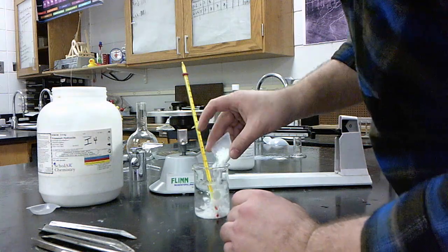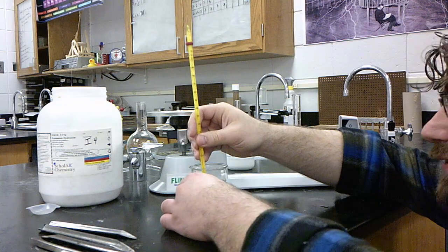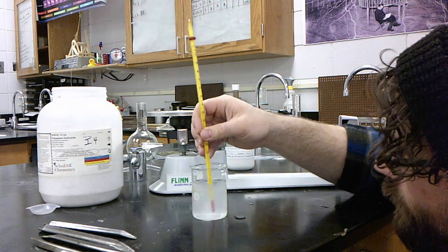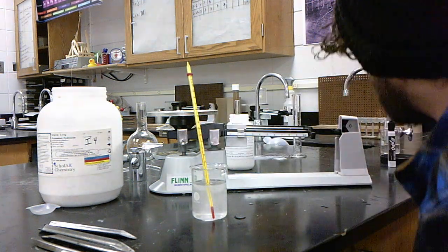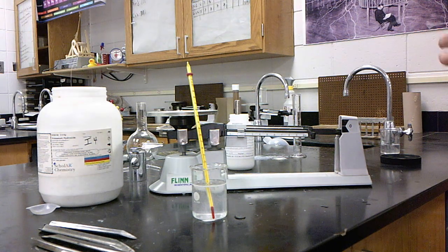So let's dump this in. We're currently at 33 degrees. Let's see if it goes up anymore. Just give it a little bit of stirring action here. We're holding steady at 33. Okay. So with the ammonium nitrate, we went down 10 degrees. With the potassium hydroxide, we went up 11. Interesting. Okay. So now I'm going to clean this up, and let's analyze those results.